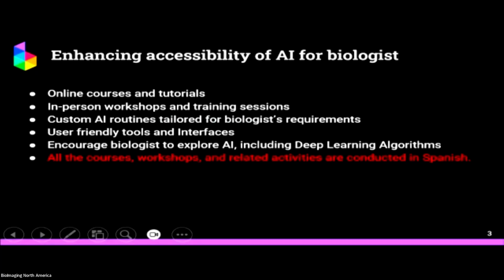What I always say is that biologists should use all those tools that we have available. They are really, really nice tools that you can use. You just upload your image, and you are going to have something automated, and it is going to get very, very good results for image analysis. Beth already gave some really nice tools that the community is working on. So I really encourage that.